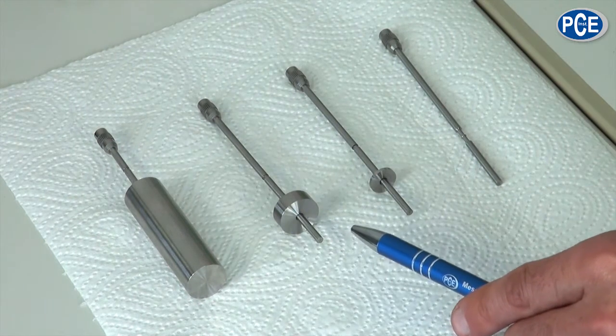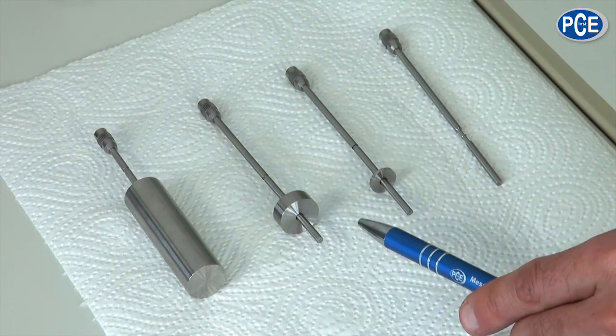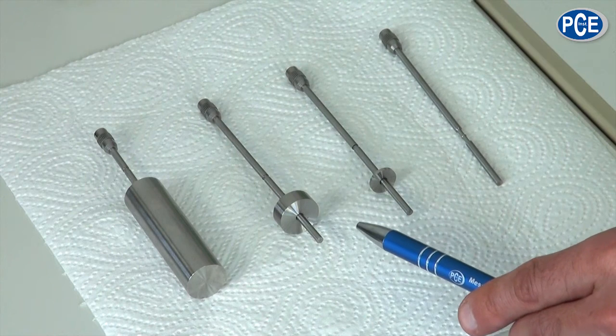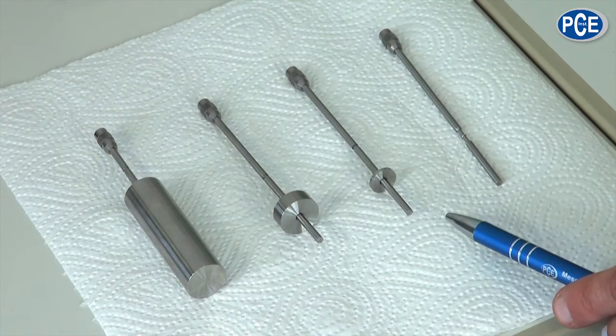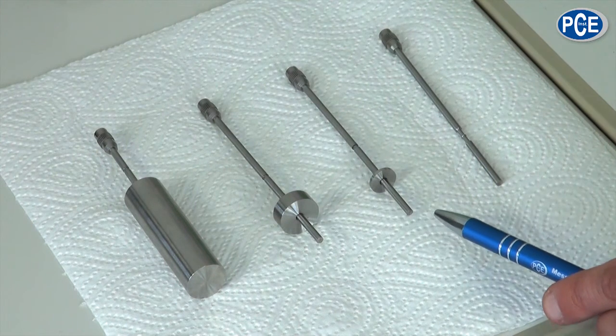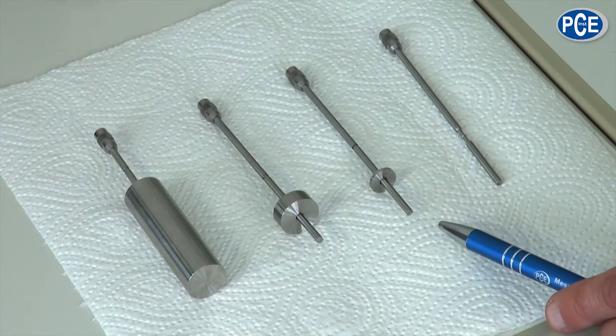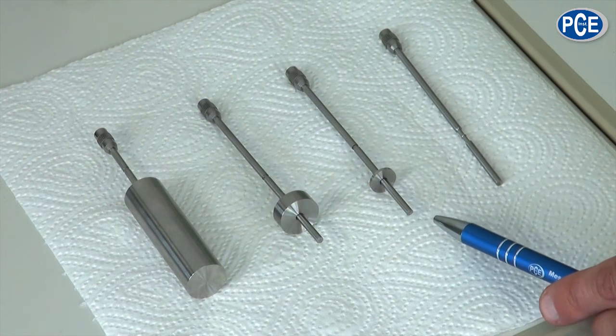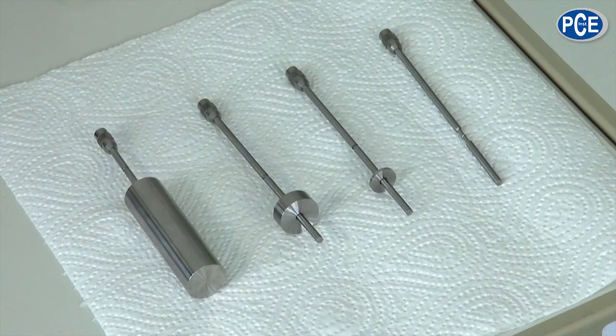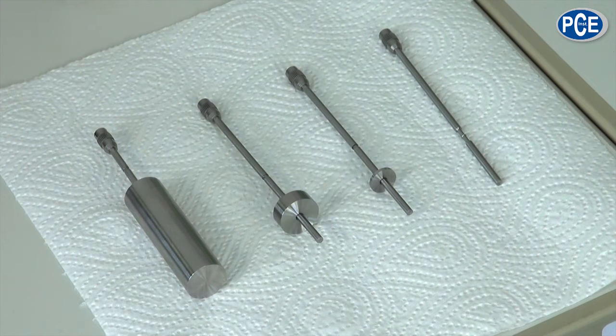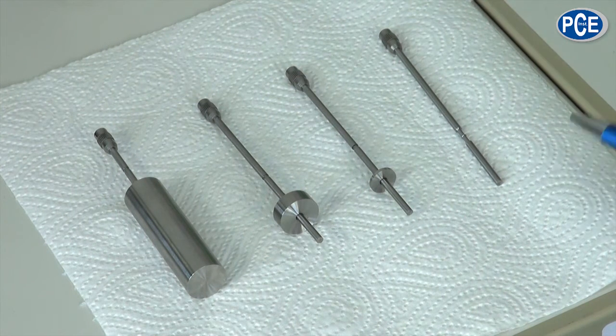The rotation body 2 covers a larger measuring area of up to 5000 mPa·s. Rotation body 3 goes a step higher, covers a measuring area of up to 20,000 mPa·s. Rotation body 4, the smallest rotation body, has the highest measuring area of up to 100,000 mPa·s.